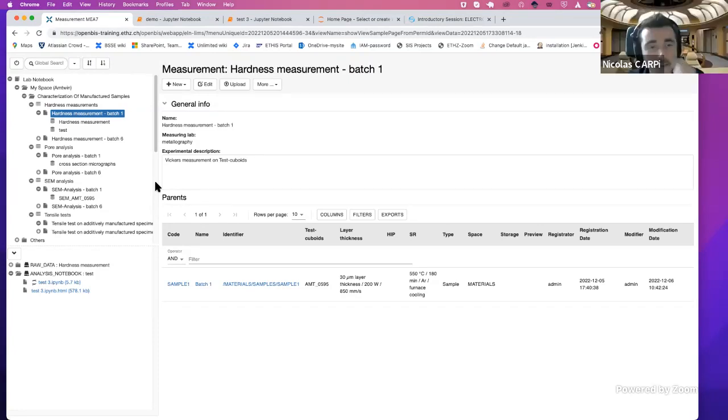Yes, Katerina, I have a question about the audit trail that you show. So you record all the change and everything, great. How can you guarantee that this audit trail cannot be modified by the admins, like the sysadmins? So you need to go to the database and modify directly the database of openBIS. This I don't know if we have a good way to prevent this, that someone cannot modify the database. At the moment, we don't have a good way for that actually.